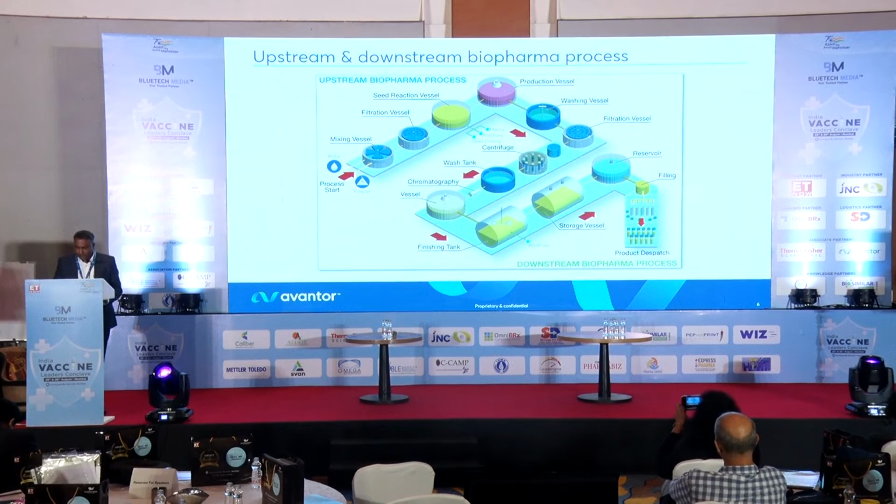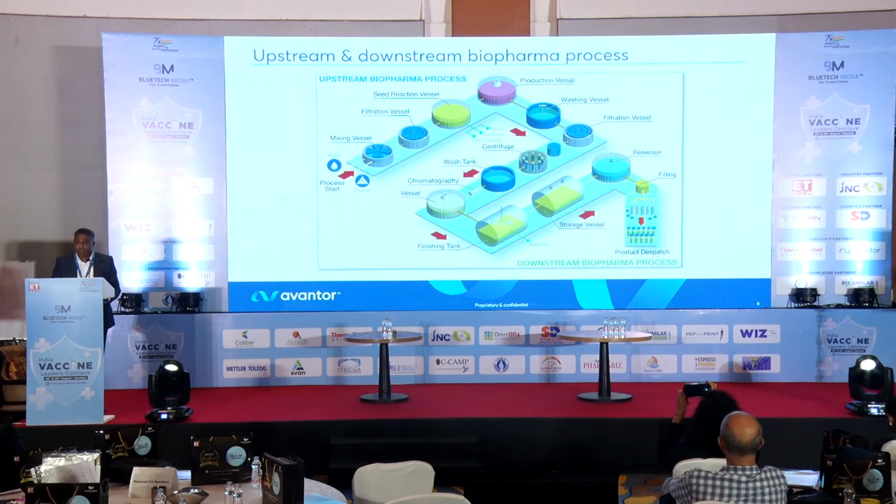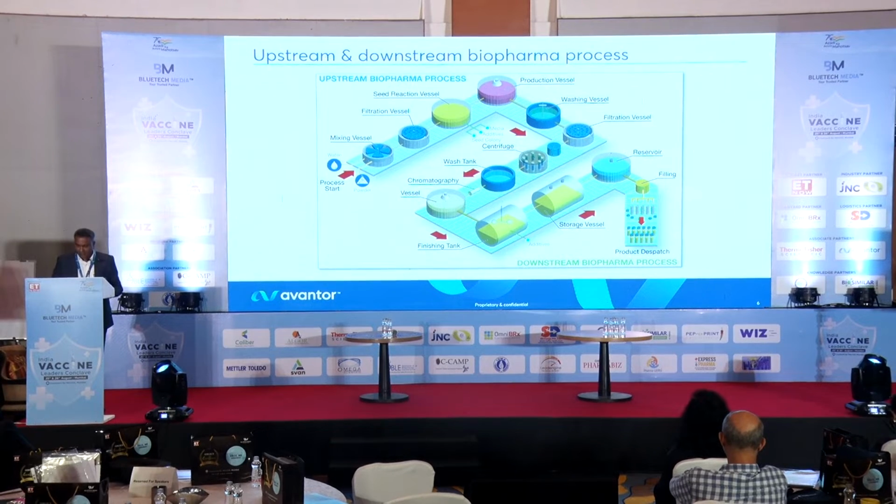While size and scale change at every stage, the workflow remains similar. Basically, cellular selection and initial growth optimization, then full production, then harvesting the target material, then cleanup. Testing and packaging is the last step.